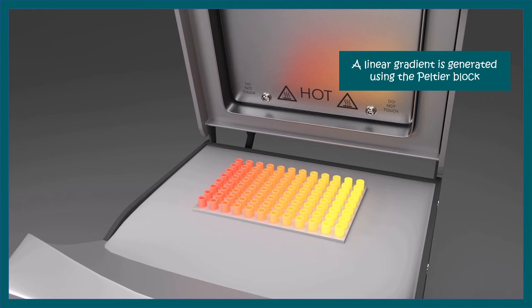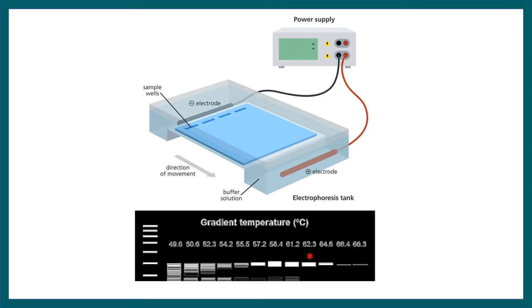So a linear gradient is established with the help of a Peltier block, which is inside the PCR machine. And once you are done with the PCR and run your product in the agarose gel, you get the amplification as a function of temperature.